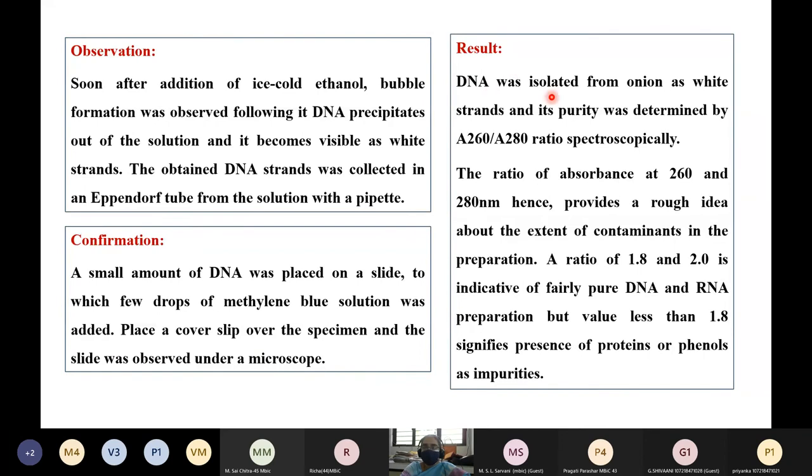The result: DNA was isolated from onion as white strands, and its purity can be determined by taking the absorbance at 260 nm and 280 nm and calculating the ratio spectroscopically. The ratio of absorbance at 260 and 280 nanometers provides a rough idea about the extent of contaminants present. A ratio of 1.8 to 2 indicates pure DNA and RNA preparation, but any value less than 1.8 signifies the presence of proteins or phenols as impurities.